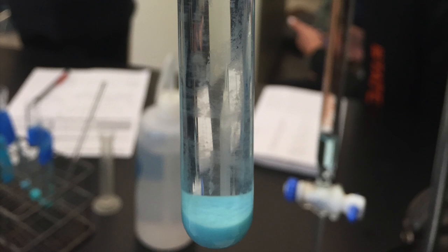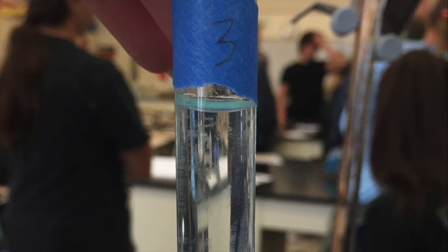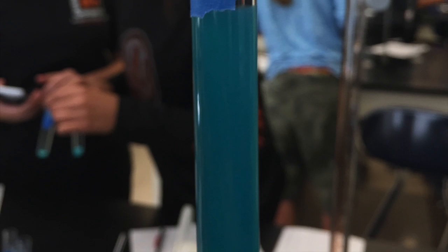The errors in our reaction that occurred were a transfer error in test tube 3 because precipitation levels were low, along with a measurement error in test tube 8 as the measurements and precipitations were off.